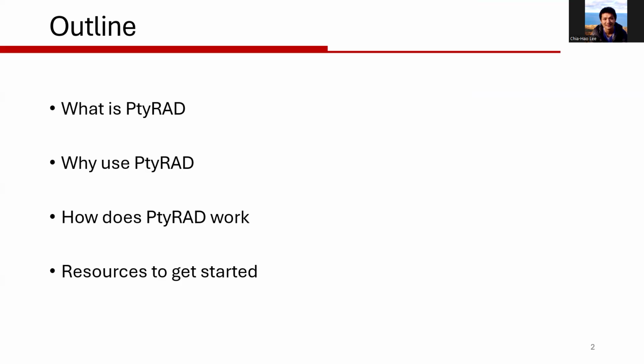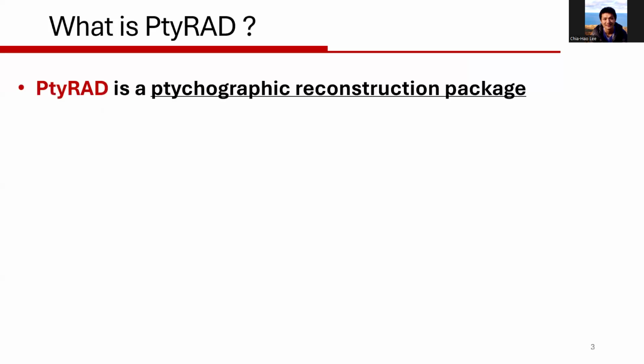In this video, I'm going to talk about what is PtyRAD and why do you want to use PtyRAD? And then we're going to move on to how does PtyRAD actually work? And everything's going to be very high level because we actually make a series of videos that's going to get into more details of how would you use PtyRAD and how to get the result that you will want. And all these lovely details will be coming out later. And lastly, I'm going to cover some of the useful resources that you want to check out so that you can get started in a smooth way.